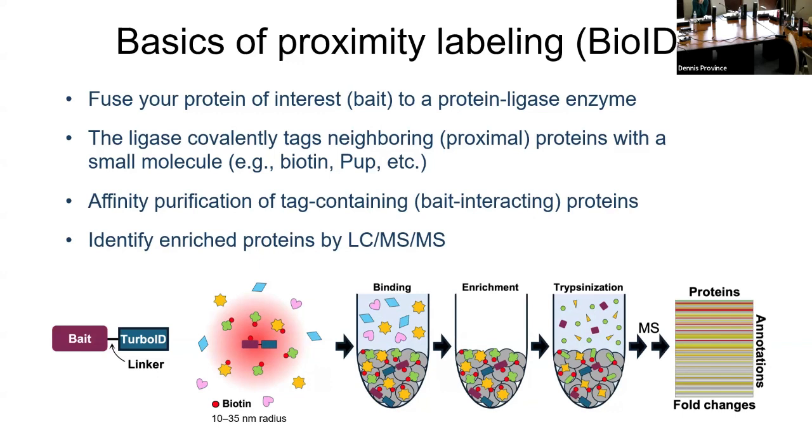It converts biotin, which is just a vitamin, what is it, B7, into an unstable radical, which then will react with lysine residues on nearby proteins to form a covalent bond. So it's not a specific targeted event like phosphorylation where it recognizes the binding site. It's literally just leaving a trail of these unstable biotin molecules that then attach to whatever they're going to attach to.